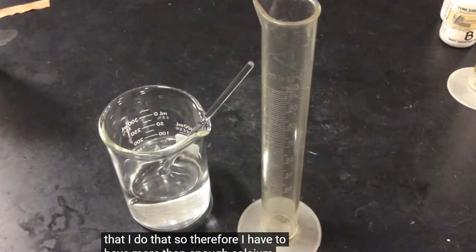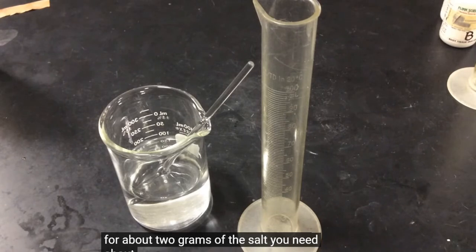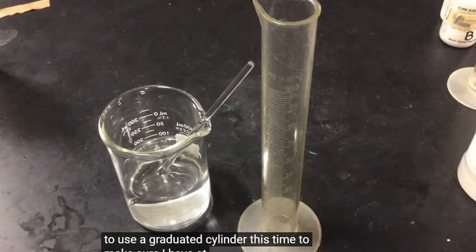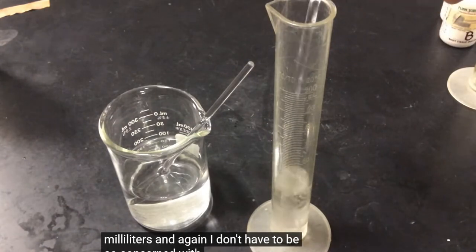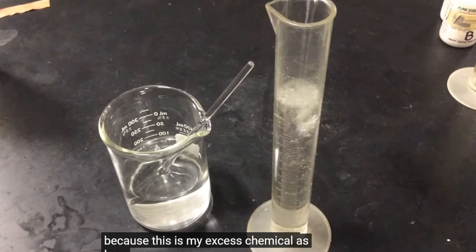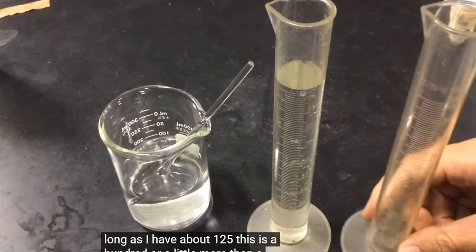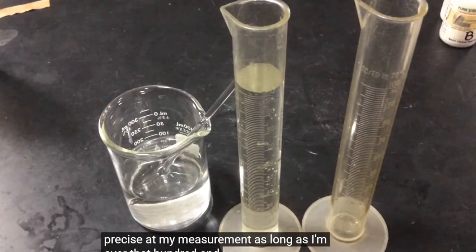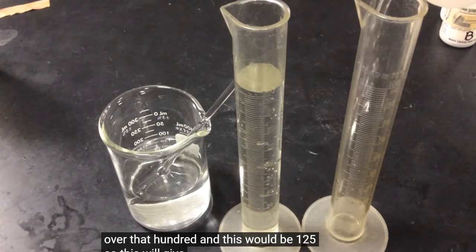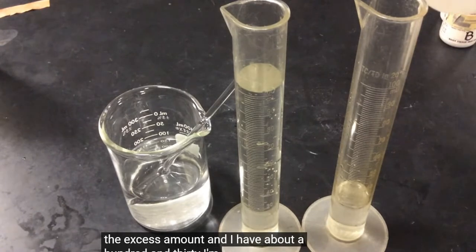I've done the math already. For about 2 grams of the salt, I need about 125 milliliters. So I'm going to use a graduated cylinder this time to make sure I have at least 125 milliliters. I don't have to be so concerned with the measurement because this is my excess chemical. As long as I'm over that 100, and this will be 125, this will give me an excess amount. And I have about 130. I'm just making sure that I have more than enough.